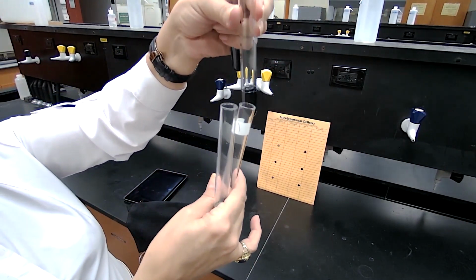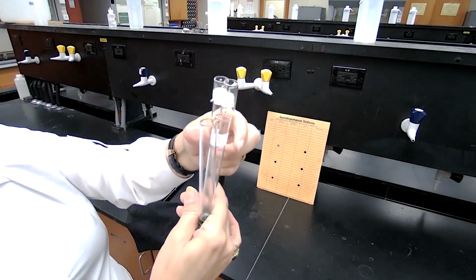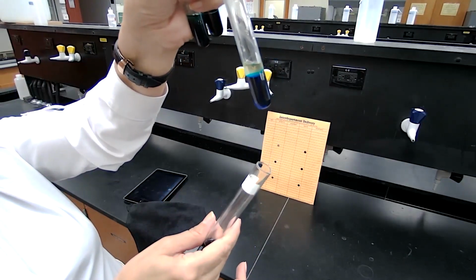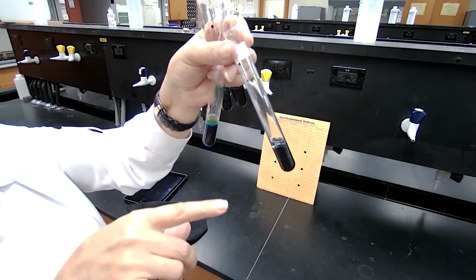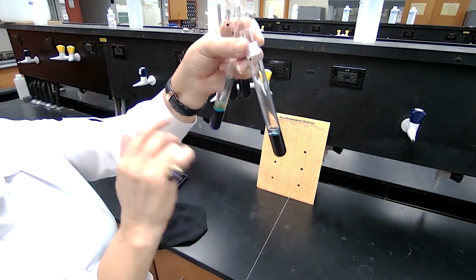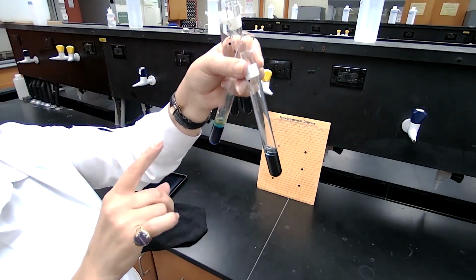The same thing happened with unknown number 2: a second, clear layer is formed. And unknown number 6, this was the solubility in water. I kind of went backward, and I thought adding the food coloring to water might show the layers better.